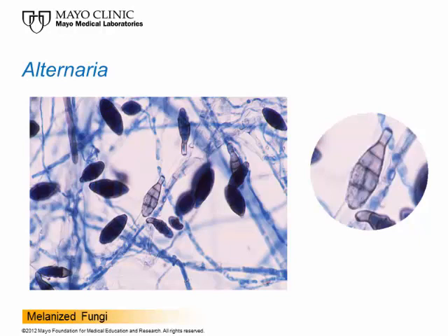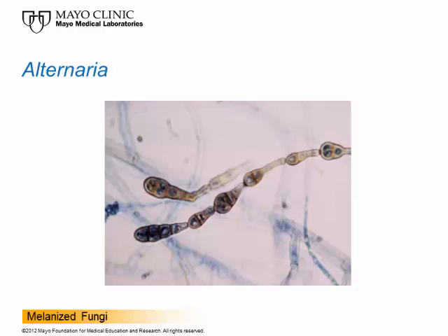Notice that some of these Alternaria conidia are very dark — you can't even see the septations in them because there's so much melanin in the cells. Sometimes cells just have brown pigment that is so dark it's very difficult to tell what they are. You can see the long beak and the horizontal and longitudinal septations, but it's hard to see except in lighter cells. You have to look at all the slides and examine every field to find good examples.